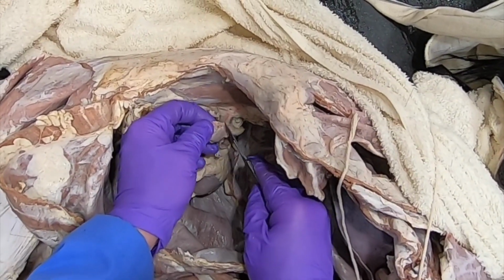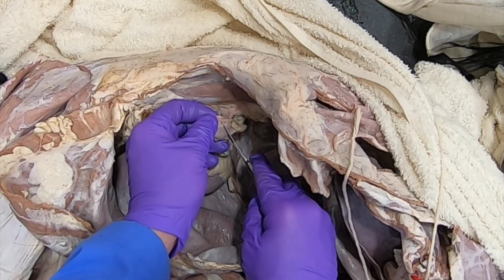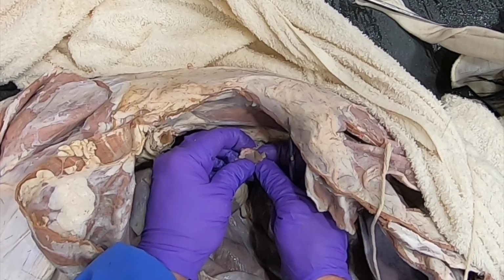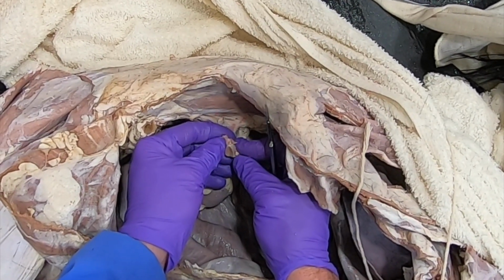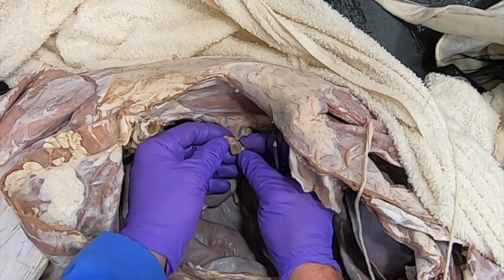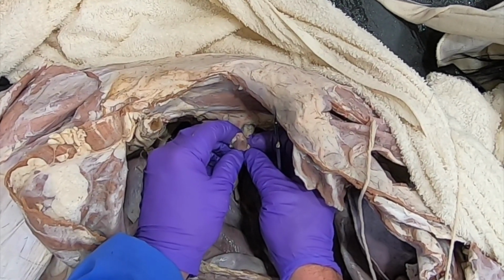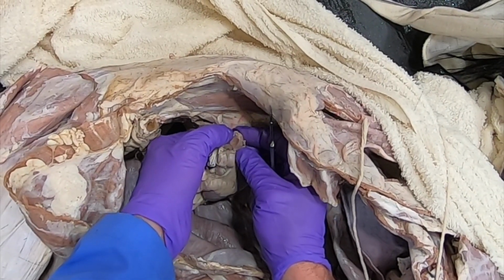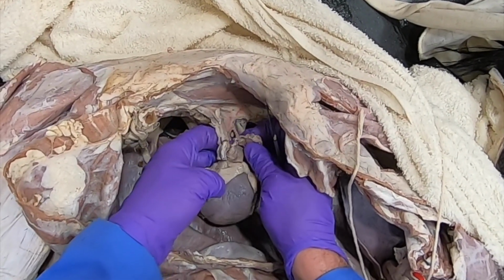Here we go. So this structure at its cranial pole, if we cut it, oh, this one's not very good. It should have a prominent cortex and medulla. This one doesn't have it so much.